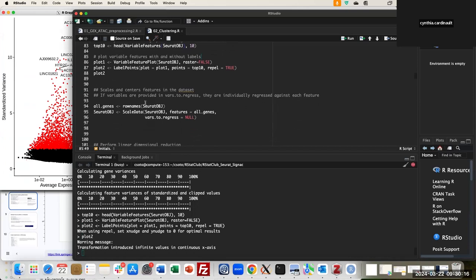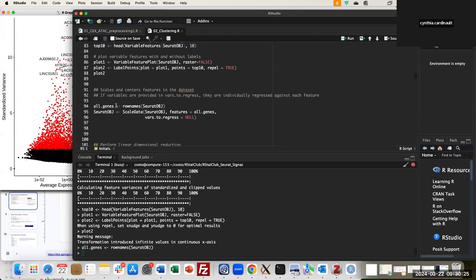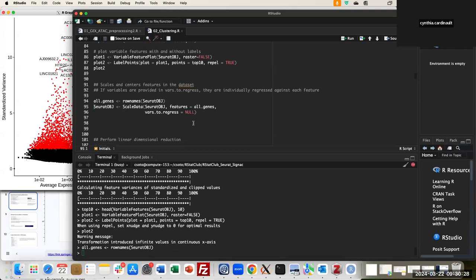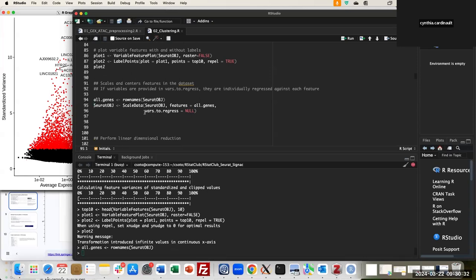The next step is to scale the data. Under this approach, we use all genes, but you can also specify a subset of genes. There is also a parameter called 'vars.to.regress' — analogous to the one in SCTransform — where you can provide variables like mitochondrial percentage to regress out. I'm going to run it with null values since regressing takes more time.